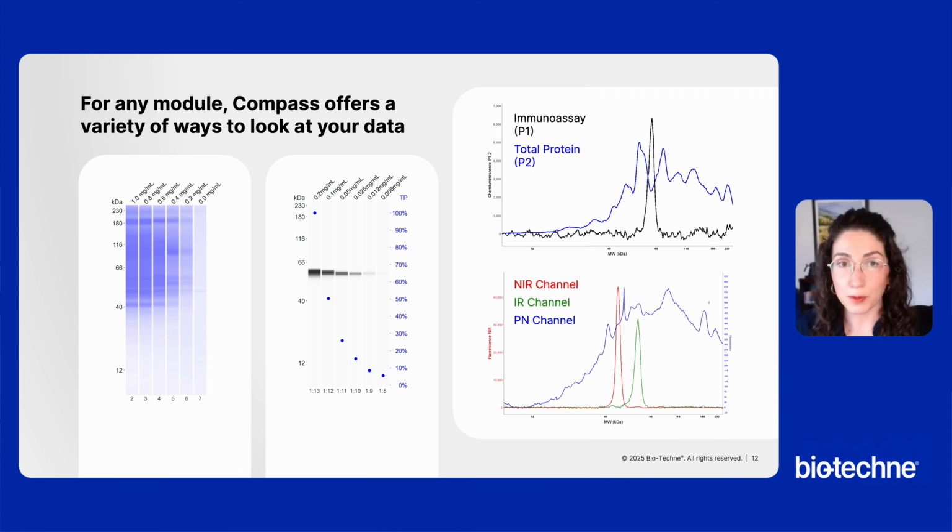On the very right, we have the electropherogram views, which offer the most detail into your data. Compared to the lane views on the left, the graph views give insight into the peak area used for quantitation and provide more depth into the protein distribution throughout the capillary.